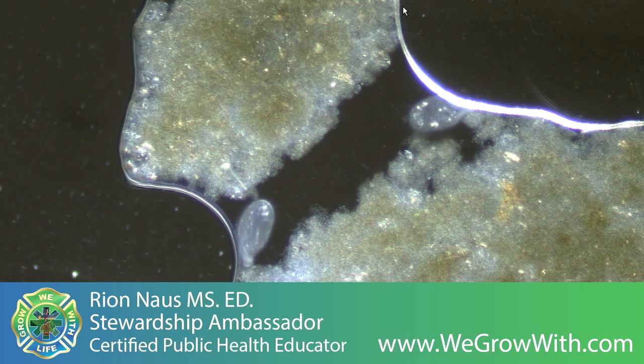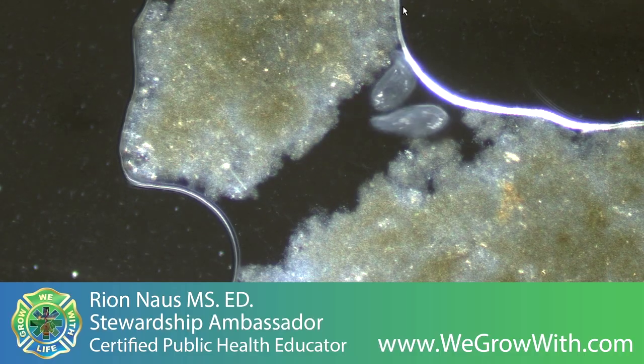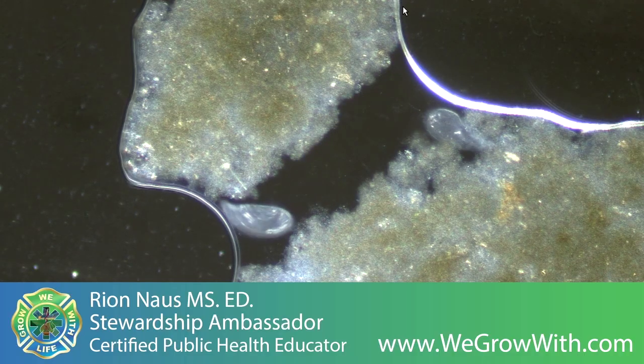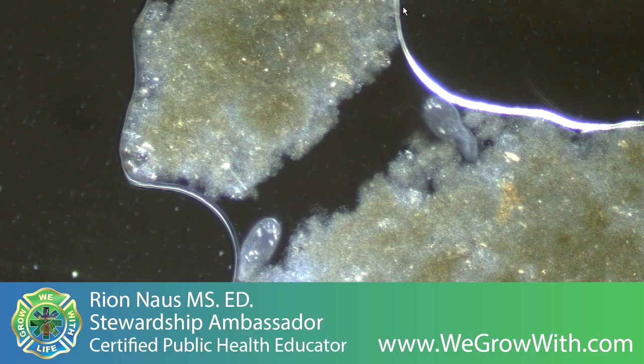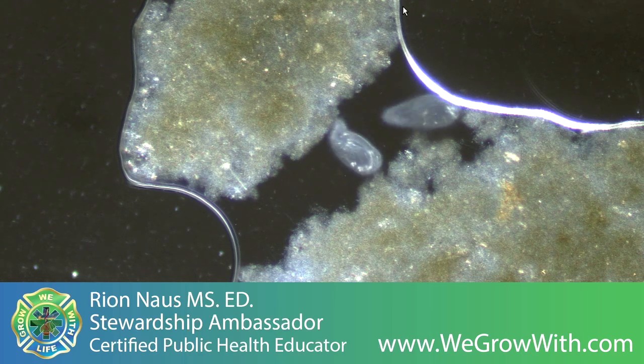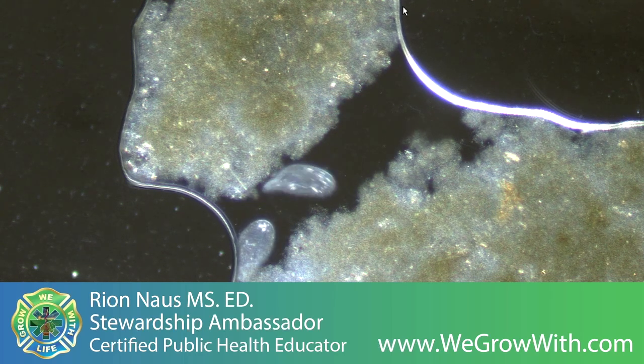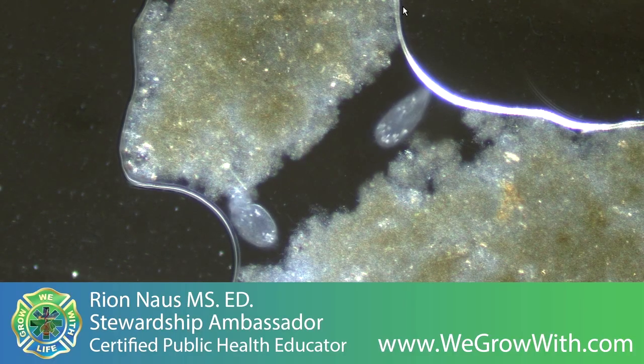This is the only water that exists in that system. It's all dried out. The mycorrhizal fungi can access even this interpore space fluid and be able to share that, service that to your plants.